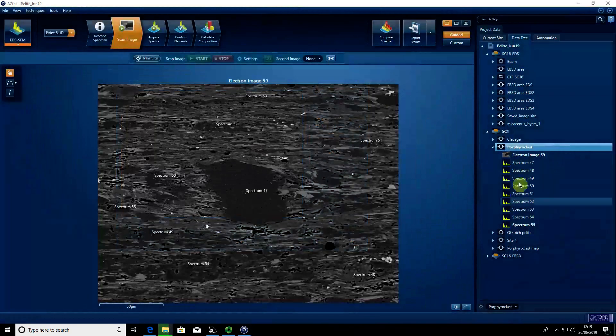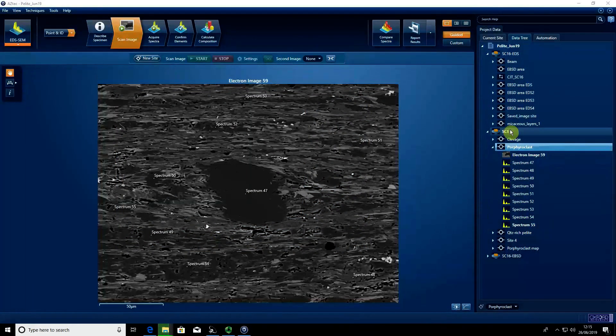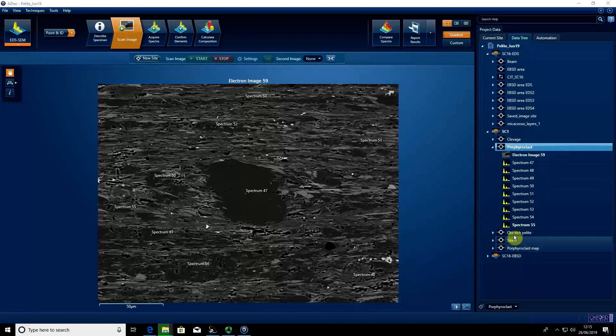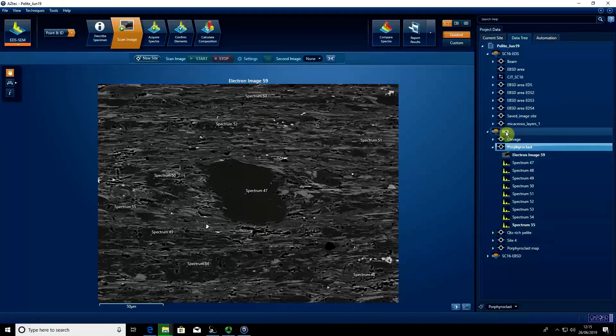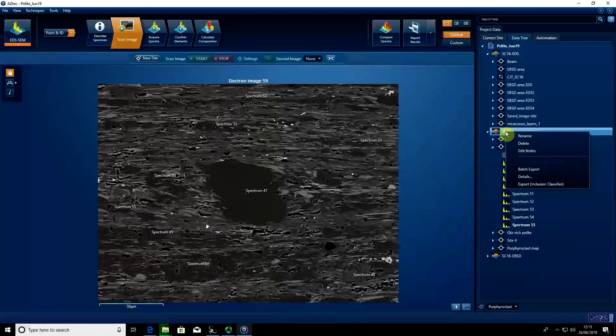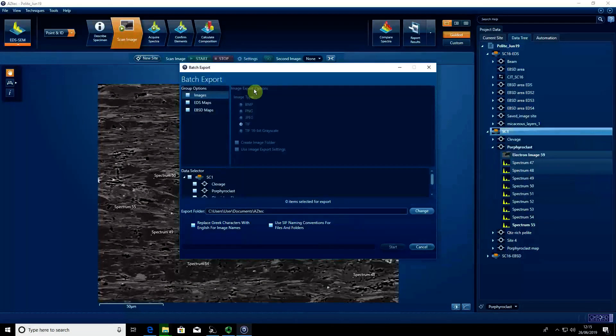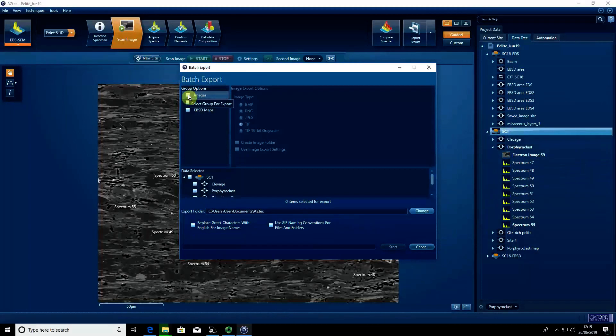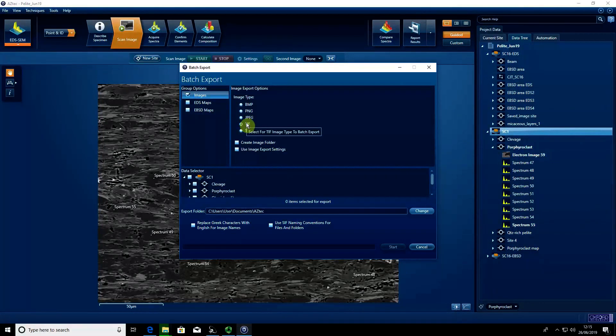I can then do that for every single site I've created in my data tree. If I right-click on the sample and go to batch export, I can select images. I want a TIFF.